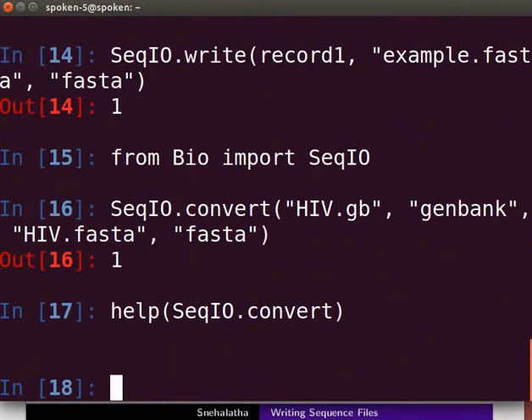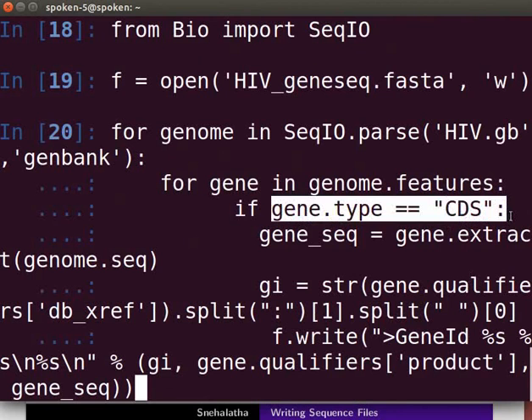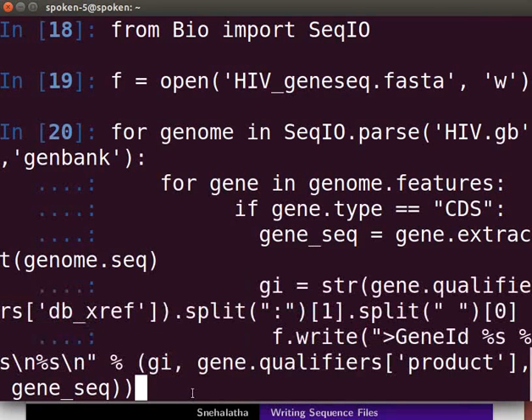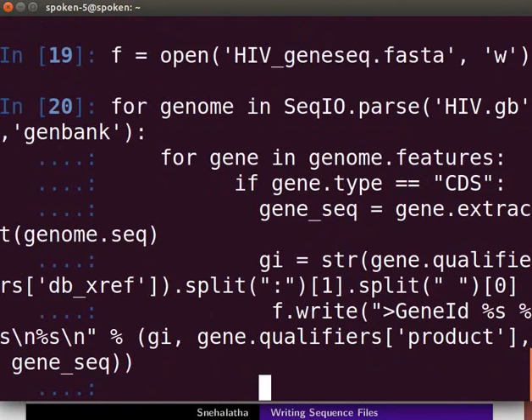We can also extract individual genes from the HIV genome in GenBank format. These individual genes can be saved in FASTA or any other format. For this, type the following code at the prompt. This code will write all individual CDS gene sequences, their IDs, and the name of the gene in a file. The file is saved as HIV_gene_seq.fasta in your home folder. Press Enter.